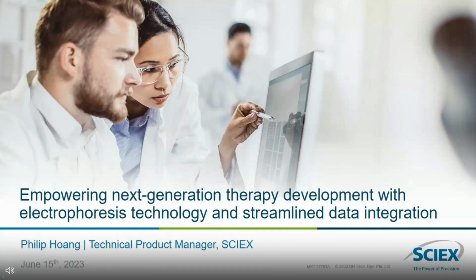All right, thank you for that introduction, and hello, everyone. Today, it is my pleasure to talk about applications for the development of next-generation therapies using capillary electrophoresis. More so, I'm excited to talk about different workflows that can be used in today's lab that relate to data collection, data management, data processing, and data analysis.